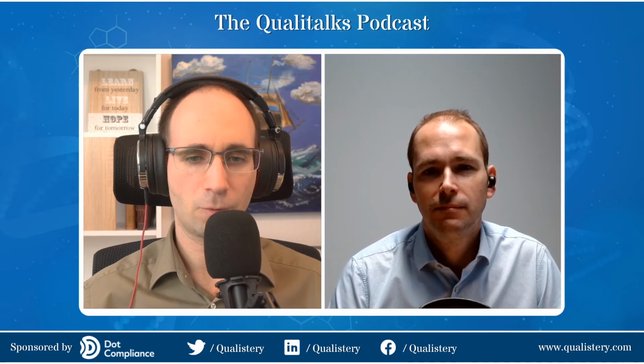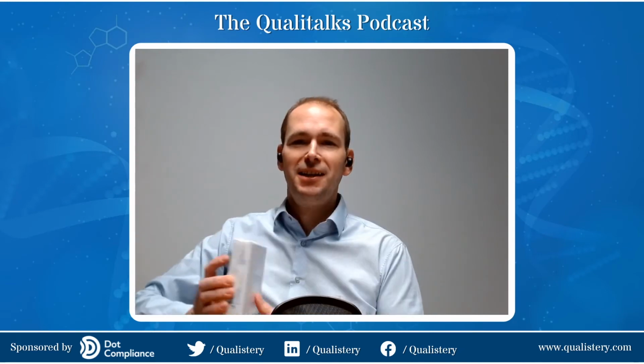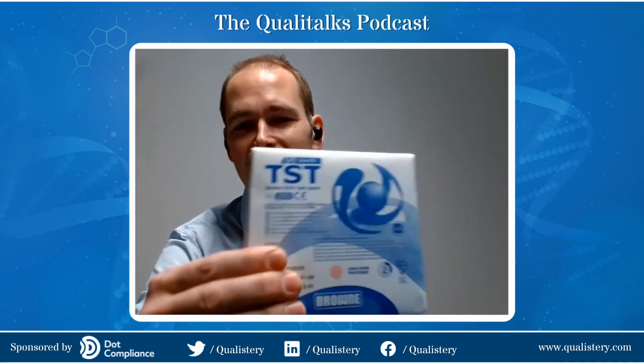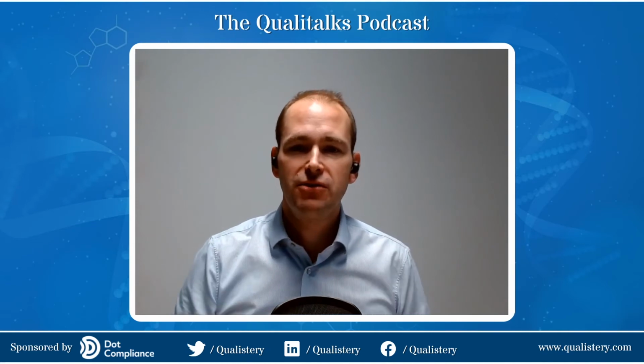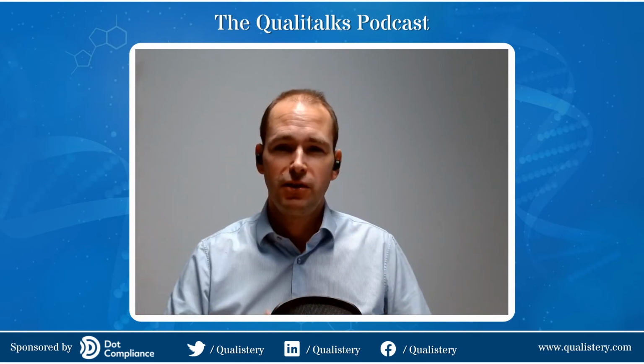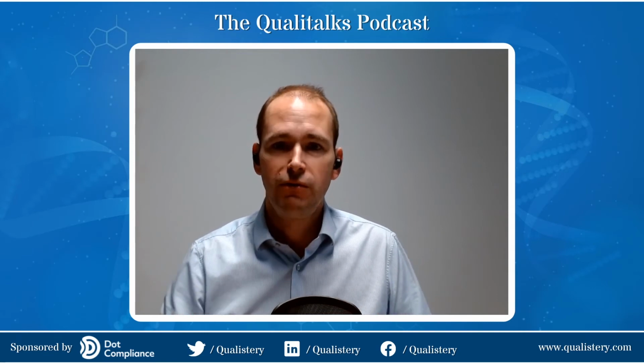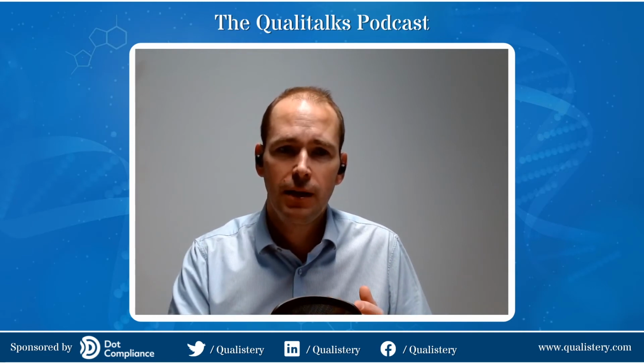Right. And are there also some kinds of worst case scenario testings? Yeah, there's routine testing that we perform. So we'll perform things like Bowie Dick tests. I've got one of those here. These go in the autoclave and they have a chemical indicator inside. So we run these on a daily basis. And that chemical indicator changes, in this case, from a yellow color to a blue color. And that tells us that we've got good air removal, so we've got good steam penetration into that pack.